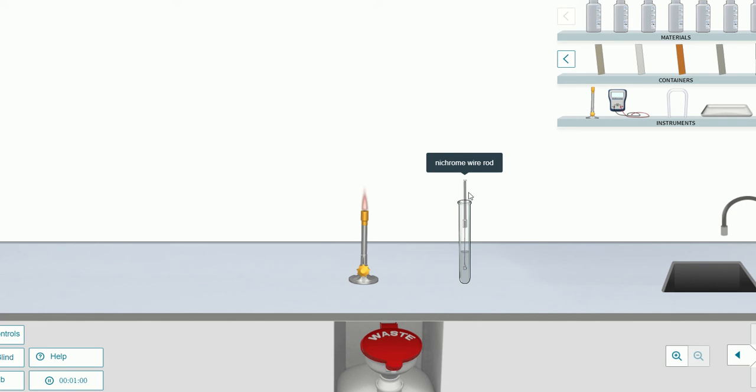And this is all part of the procedure, it describes all of this. And then you're going to bring it over to your flame, and you see how it gives you those results. So that's what you see on that example that I provided. But you'll be doing this for the rest of these solutions up here in your top right corner.